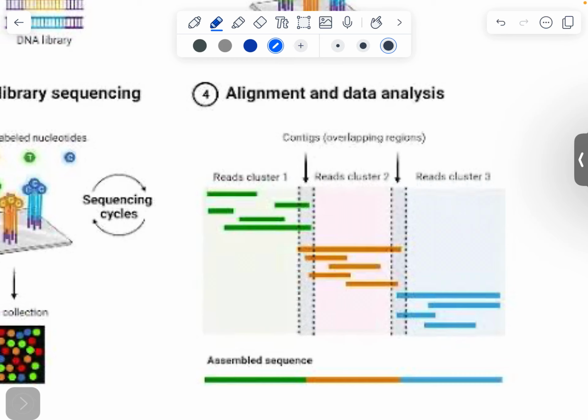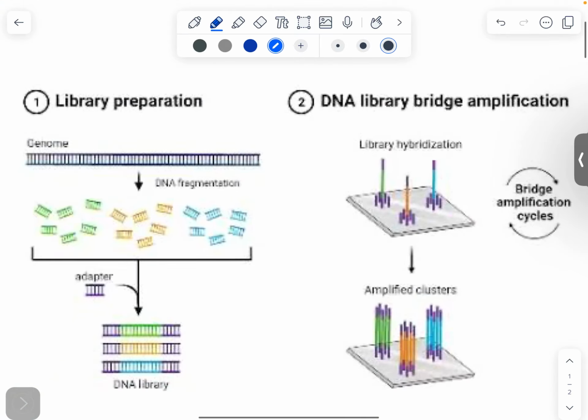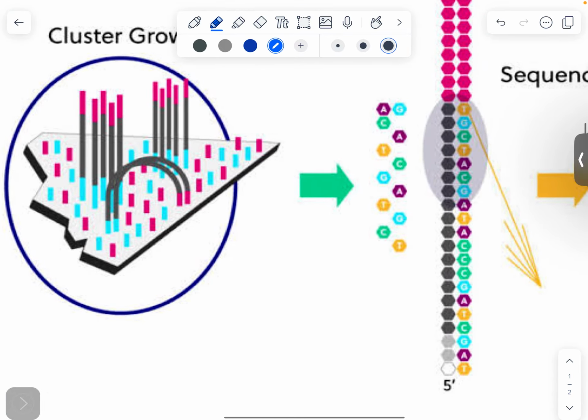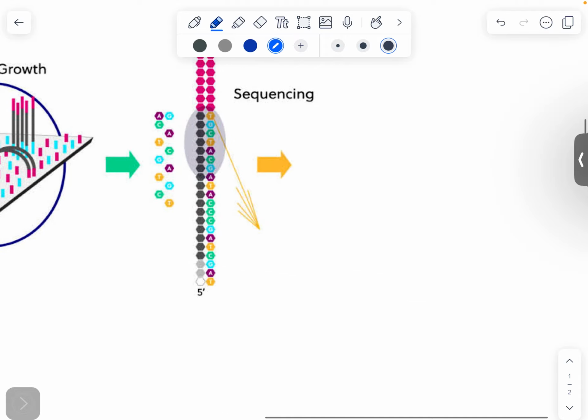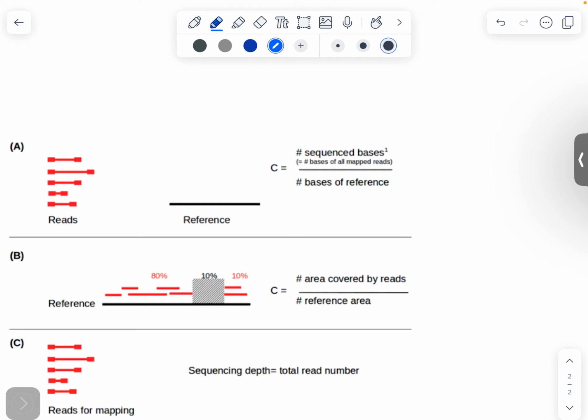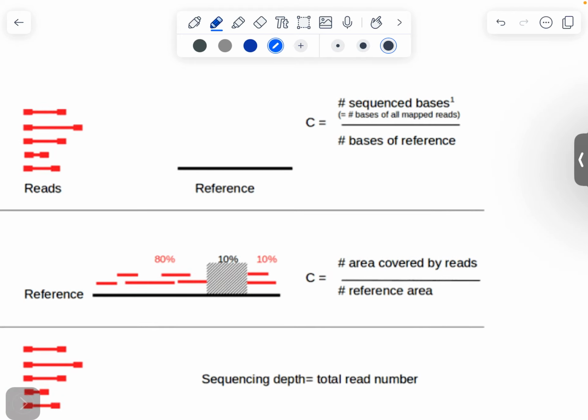When we map our reads with this reference genome, we could see that the entire genome has reads. I will show you another image where you could see that some areas of the reference genome don't have any sequences. For example, you could see this part highlighted in gray color. There you don't find any reads against this reference genome, so we call it a no coverage area.